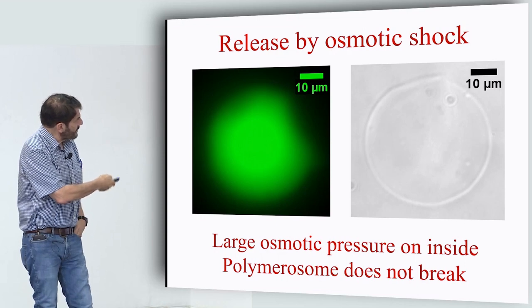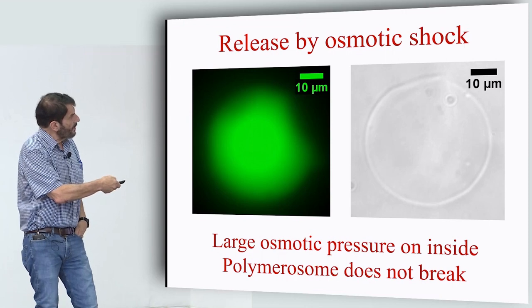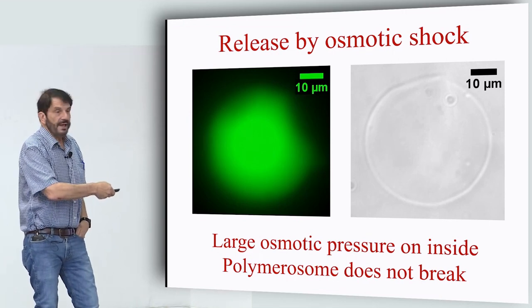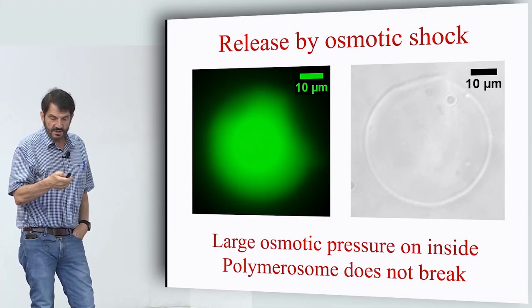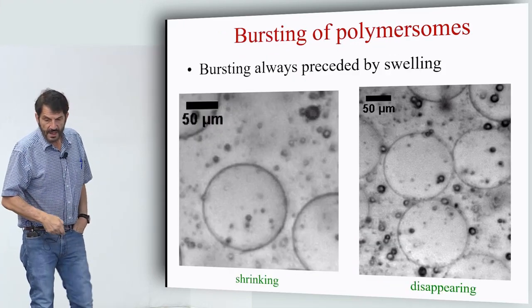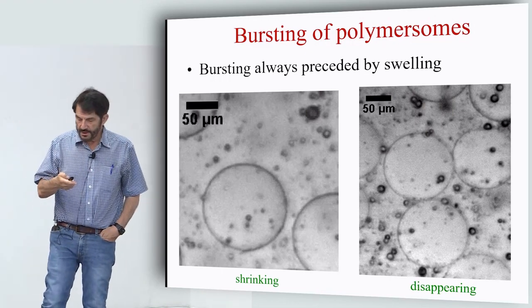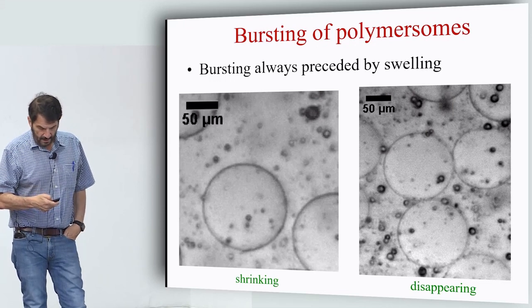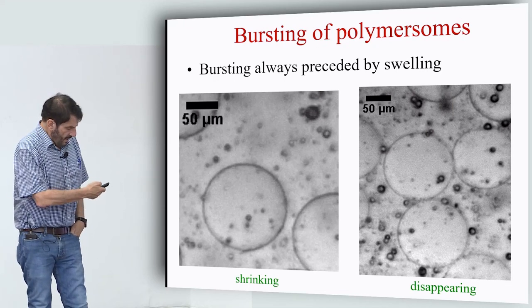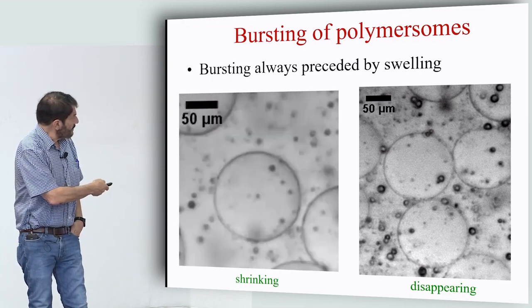Here I've encapsulated a dye. If I allow it to open up and come back about half an hour later, all the dye is diffused away. I can't show you a fluorescence image. I have to show you this bright field image. It's actually interesting to watch this bursting, to watch the explosion of the shells. Here's an example. Watch this particular structure as I expose it to very low osmotic pressure.